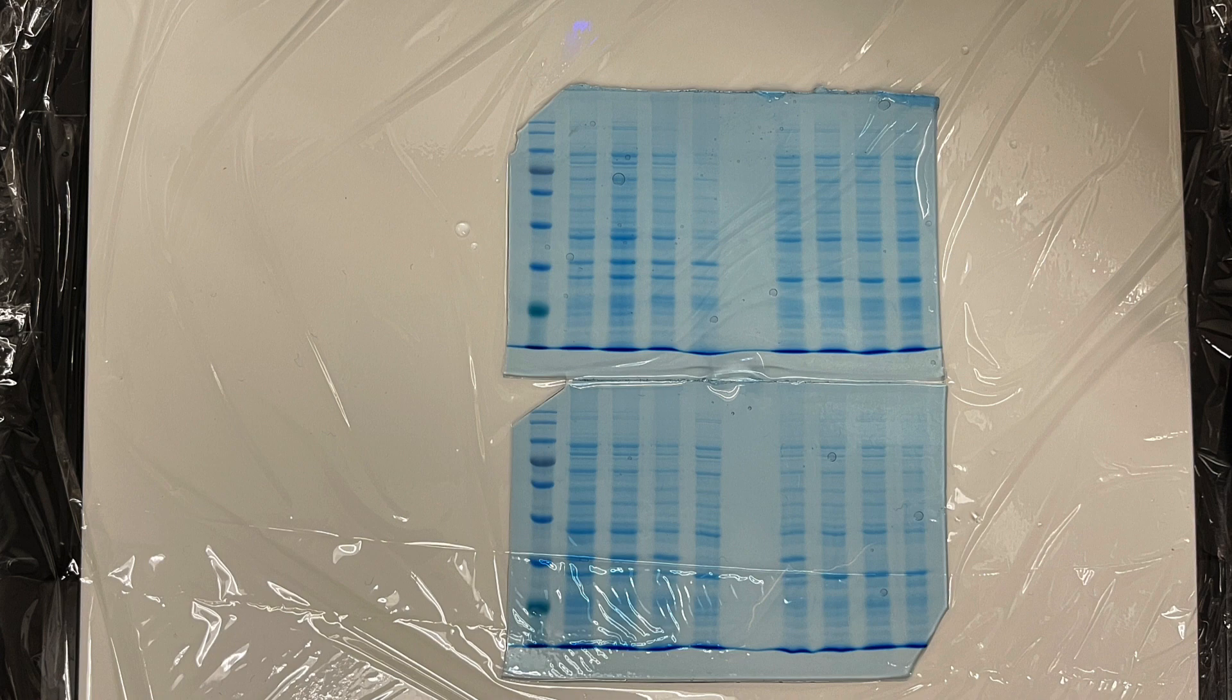When you're looking at a Coomassie stain gel, it's usually not that important. But when you're doing a Western transfer, knowing the orientation of your gel is quite vitally important, actually, because if you flip your gel the wrong way, sometimes you'll transfer your protein the wrong way. But ultimately, this is what we want to see here. What I want to see is what does my whole cell lysate look like? And generally, I'm pretty happy with what I see. I see proteins. So when I do my Western blot on these samples, I can say, well, at least these samples have proteins, so I'll feel confident moving forward.